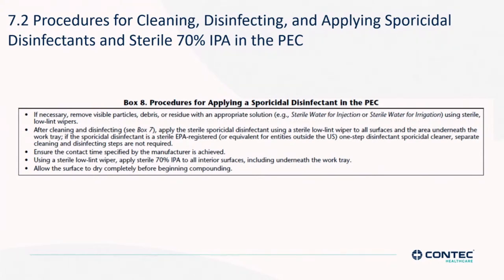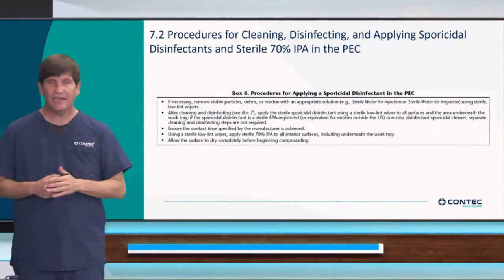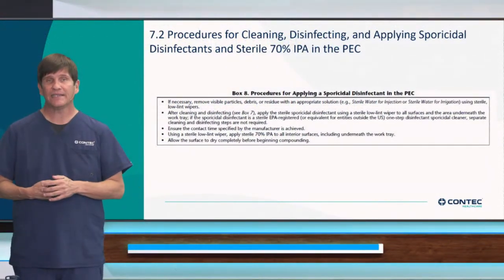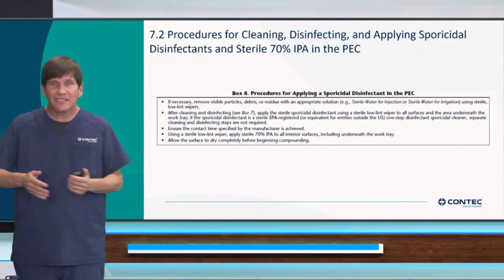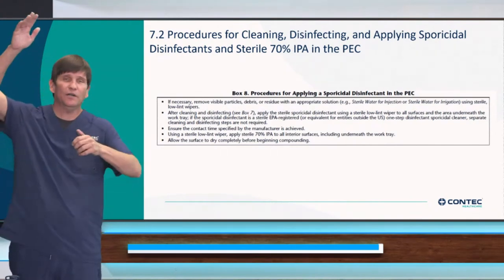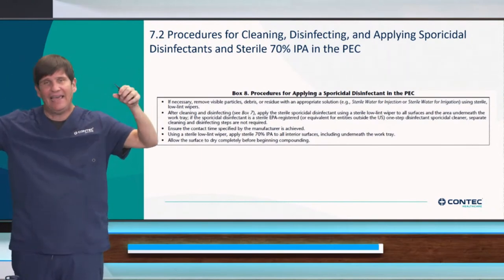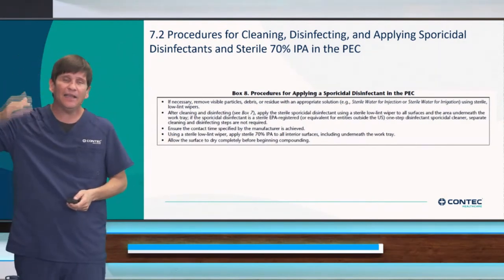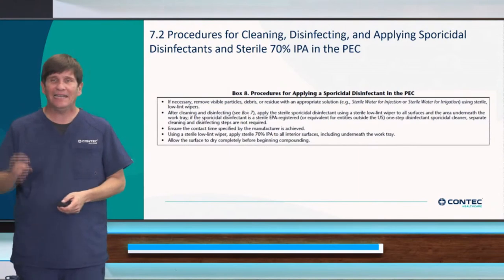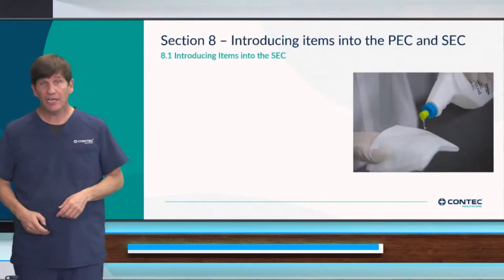So we can come back to me here on the screen. I wanted to pull these boxes out of the chapter. Again, those are very familiar, but just to stress, this is such a big change, having the must on these sterile products inside of our PEC. But other than that, the procedure is not really going to change. You're always cleaning a PEC, cleanest to dirtiest. So we'll start cleaning the ceiling and the back walls. We'll make sure I clean our IV bar and the hangers, we clean our sidewalls, clean the deck of the PEC. So the sequence is not going to change from anything in 2008. It's the products that we're using to do that procedure that are going to have the biggest change.